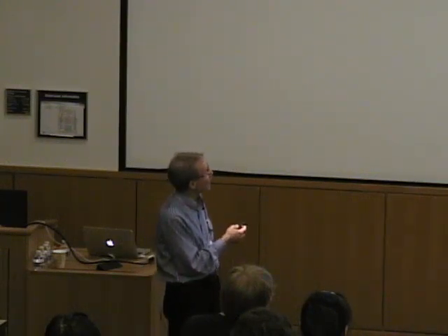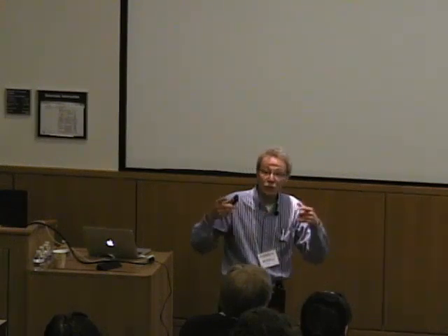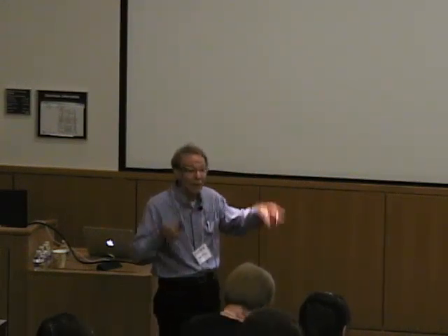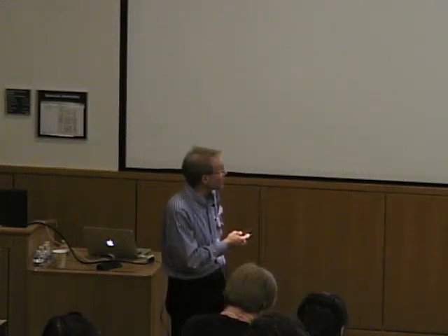Now, here's where, in fact, in the tutorial, the students are actually going to be working with fitting some data using some of these simple binding models. The ones that are commonly available are just a single site binding model, two independent sites binding model, a sequential binding model. All of this comes out of different equilibrium relationships. And one that we'll talk about a bit later is a competition binding model.